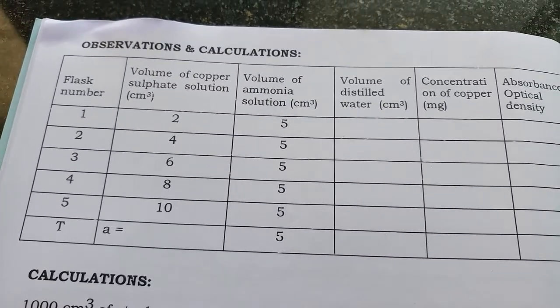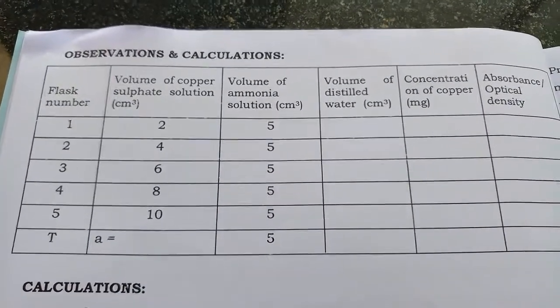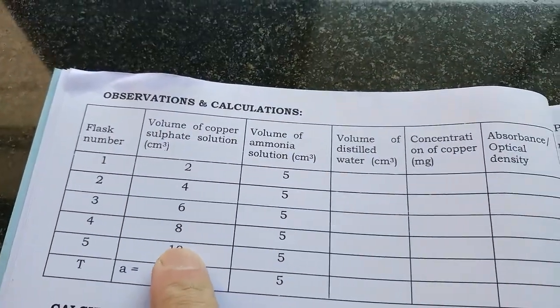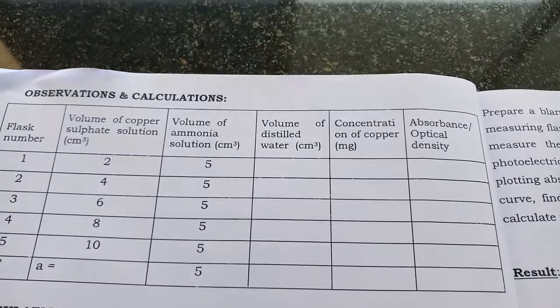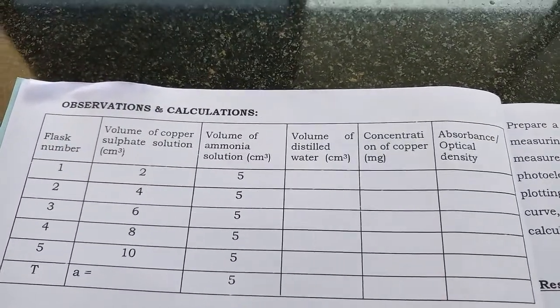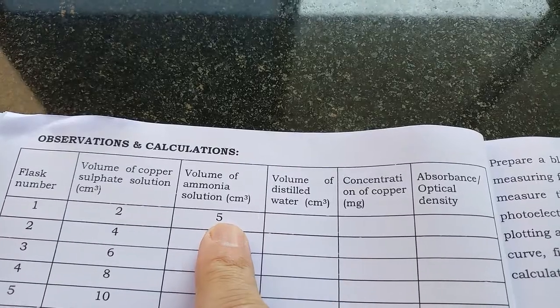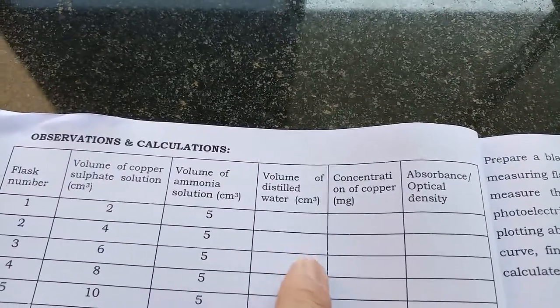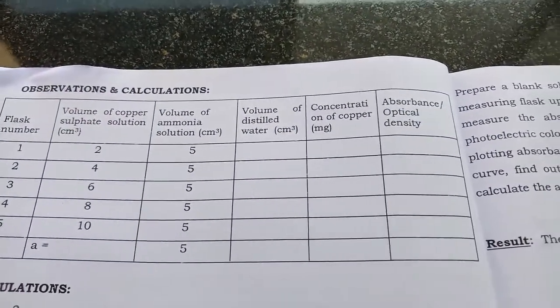A set of copper sulfate solutions is prepared in 5 different standard flasks. The volume of copper sulfate ranges: in one standard flask we take 2 ml, another 4 ml, then 6, 8, and 10 ml. For each standard flask we need to add 5 ml of ammonium hydroxide, and the rest is distilled water to make up to the mark.